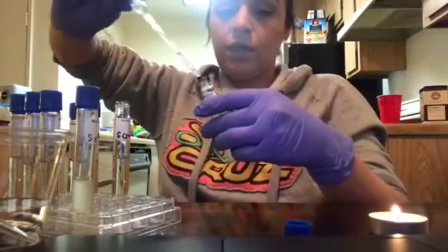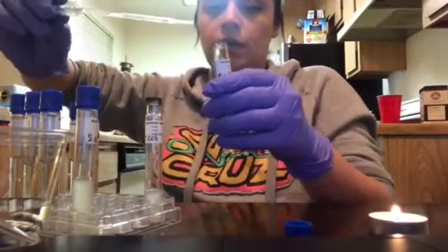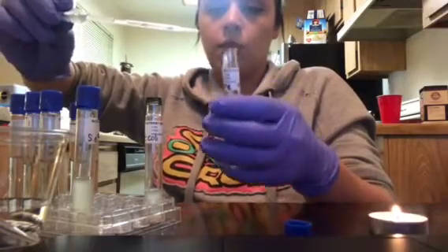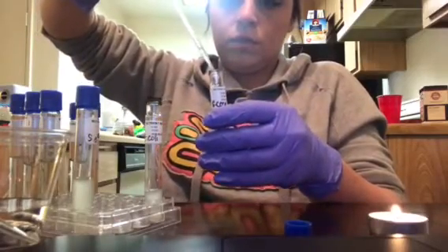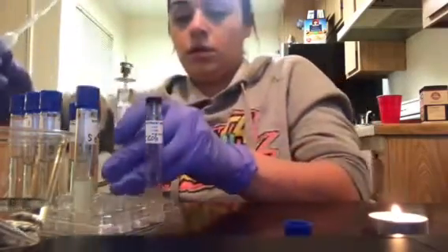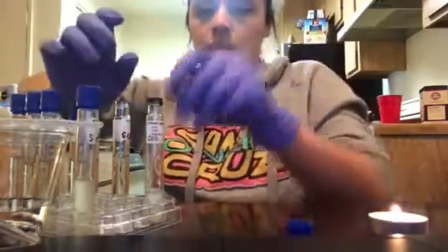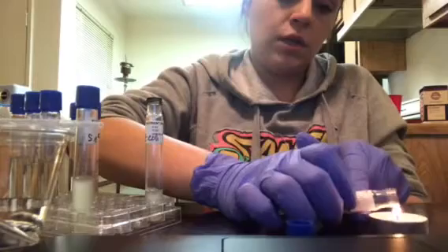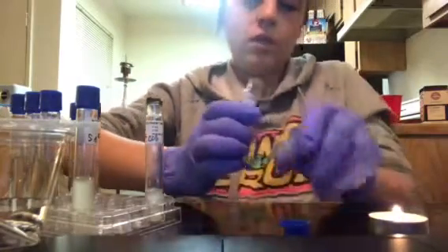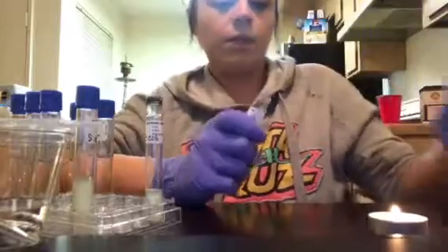So I'm just going to take some of that and I'm going to place it into the NaCl 1%, and I'm going to do 2 drops. So 1, 2. Okay. And then going to flame that to sterilize it. Put the cap back on. And I'm going to be doing the same thing for the 7% and the 15%.